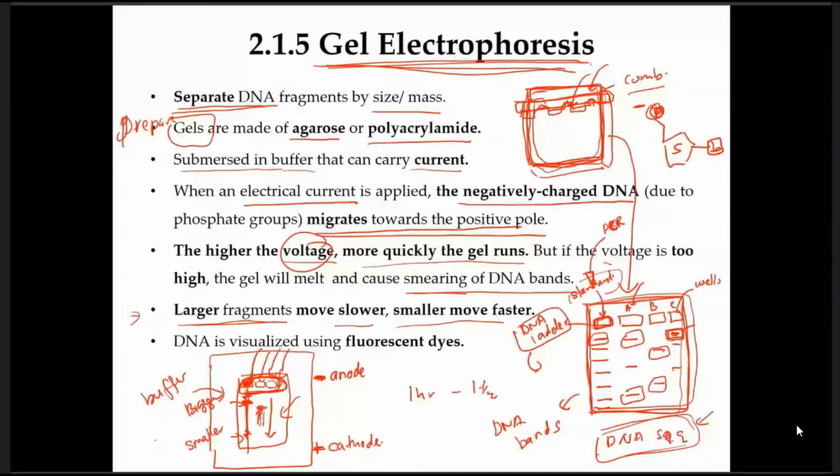Okay, so after you have run the gel electrophoresis, you take out the gel from the tank, and then you observe under UV light. Okay, dia ada mesin, macam ada satu mesin yang awak akan masukkan dia. Mesin tu akan connected to a monitor. That machine will observe the DNA band that you produce using UV light.